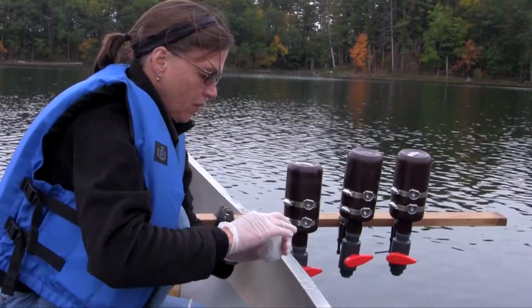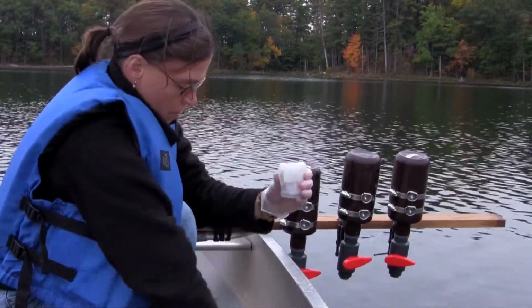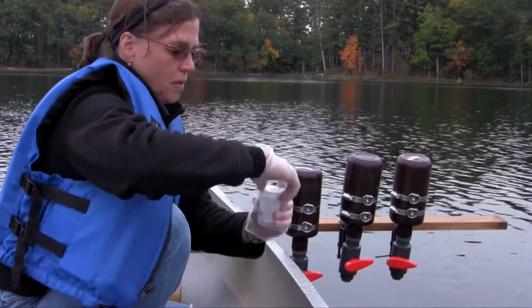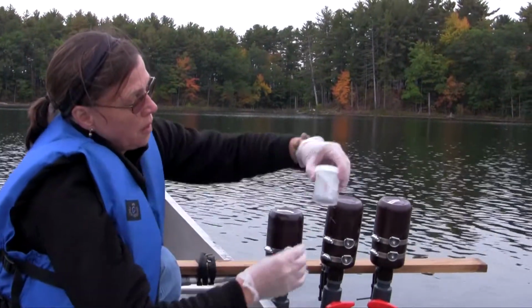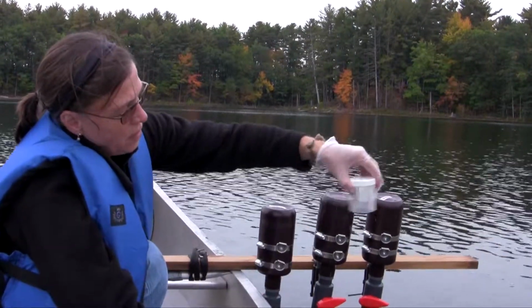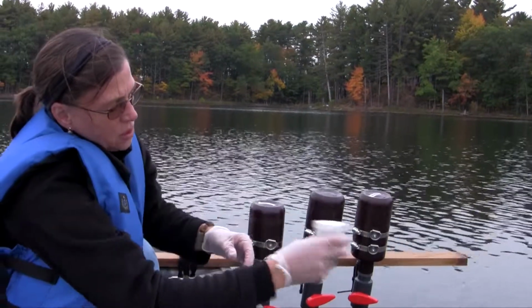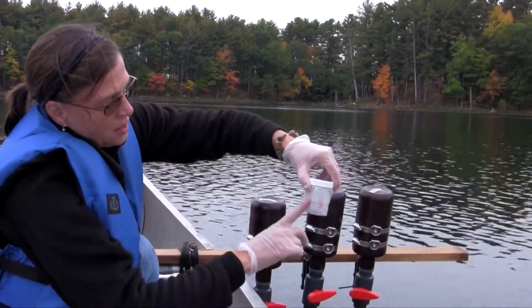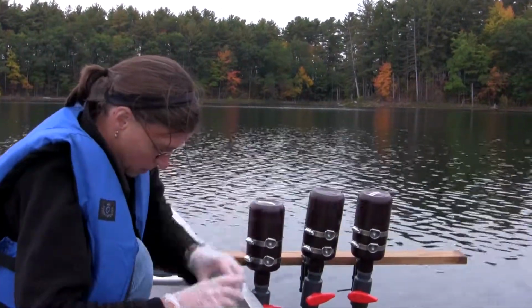So now I have all 3 of my zooplankton samples here. They're in the drying chamber. They're going to be protected. Nothing's going to tear the mesh filter. If you find as you're out in the field that you notice that this is starting to cool down a little bit, just give it a good shake and it'll heat right back up. These samples should be dry in an hour and a half to 2 hours, is my guess.